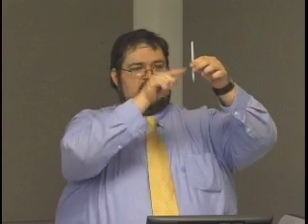The geometry of the source that you saw in there yesterday: remember, the sprayer is coming down at a 90-degree angle to the plate right there. So the sprayer is actually spraying straight down into the waste, and the ions are making a 90-degree turn into the mass spectrometer. Some other older instruments, especially the older instrument that we have, the sprayer's like this, which is why, like day one, I'm spraying it right into the hole, and so that's bad. Curtain gases have got to be higher for an instrument like this than they do for an instrument like that, and they make a lot more difference in an instrument with this sort of geometry as opposed to an instrument with this kind of geometry.